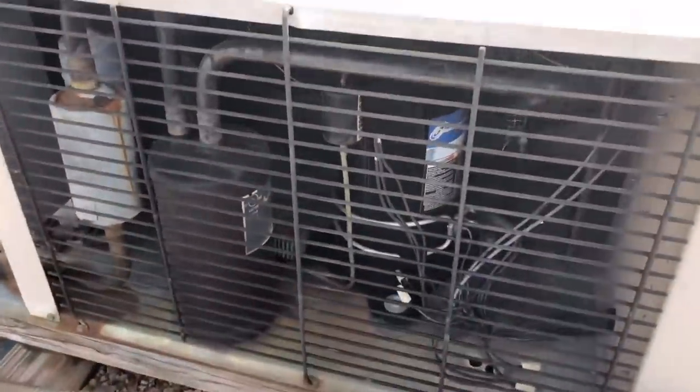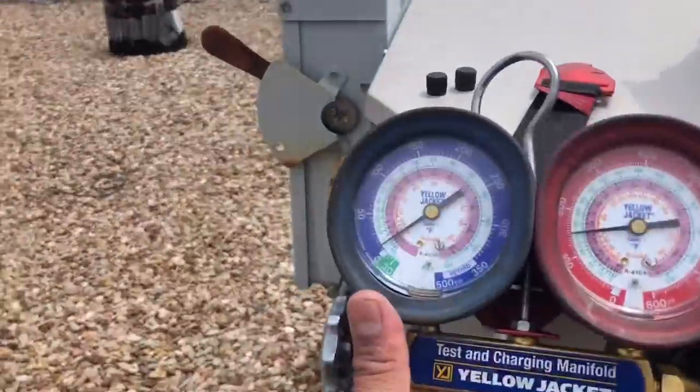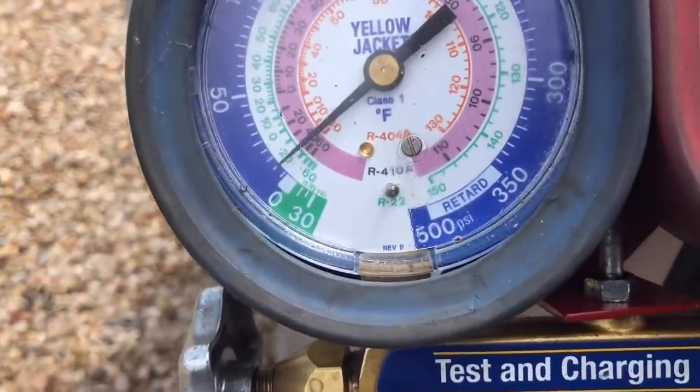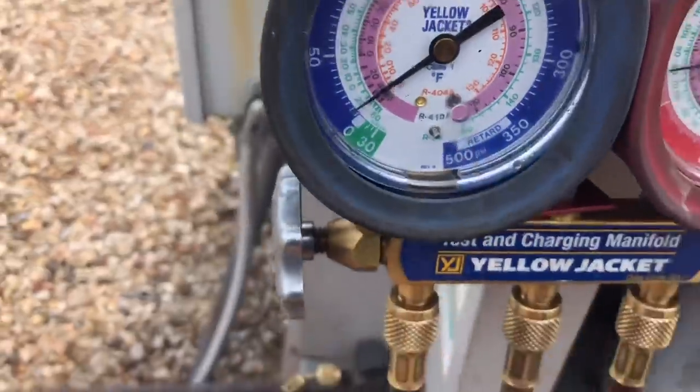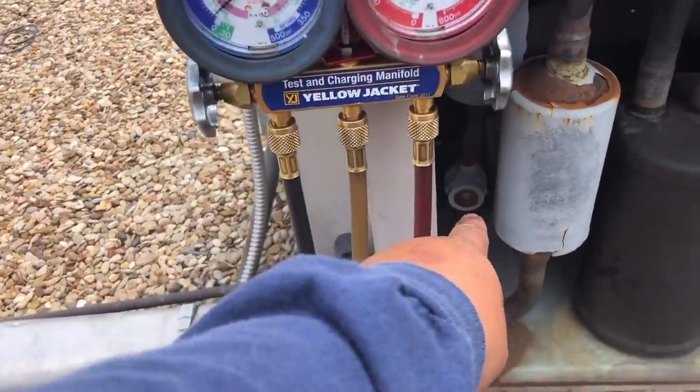Let me go ahead and open this up and take a closer look. We're hooked up to the system and you can see our head pressure is about 150, suction is about 10 psi. So we're going to go ahead and add gas until we clear that sight glass.